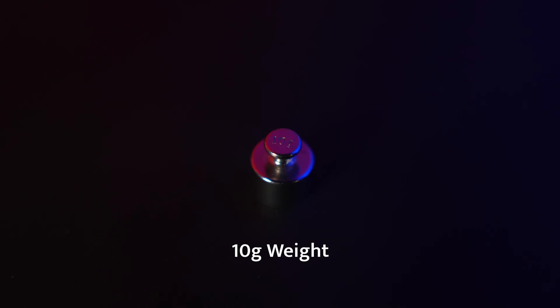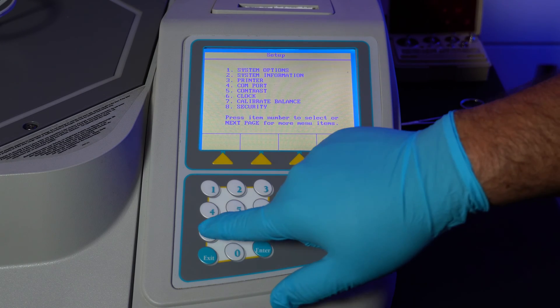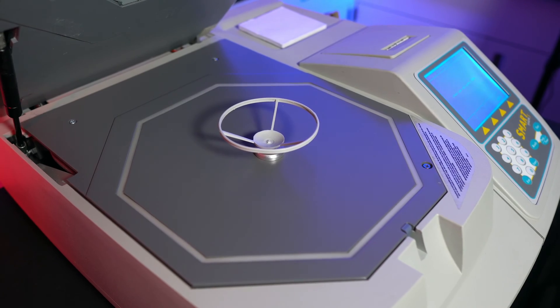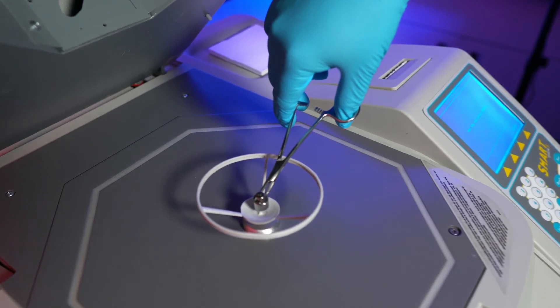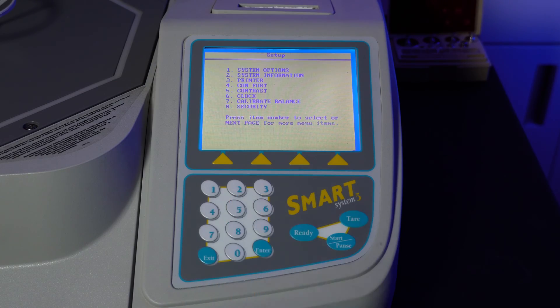Now on to the balance calibration. You will need a 10 gram weight. While on the main menu, press 4 to enter the setup menu, then press 7 to enter the calibration screen. Open the cover and make sure there's nothing on the balance. Press tear to cancel out the weight of the balance. Now you can place the 10 gram weight. Once the calibration is complete, remove the weight and press any key or exit to return to the setup menu.